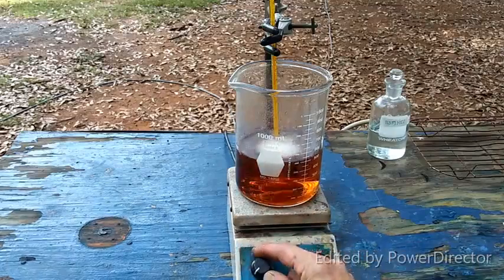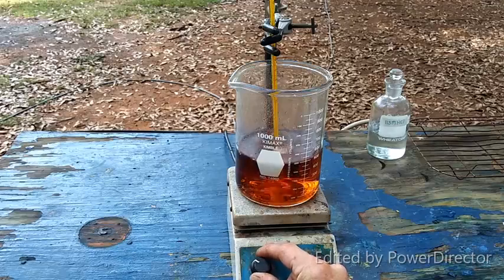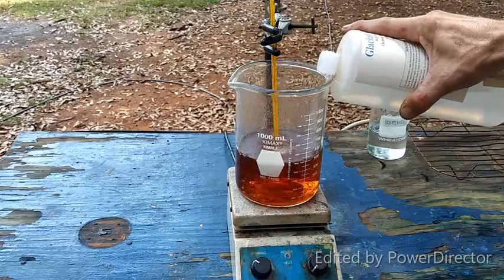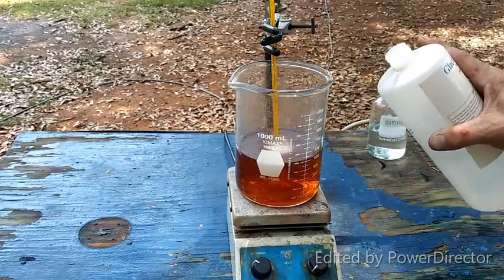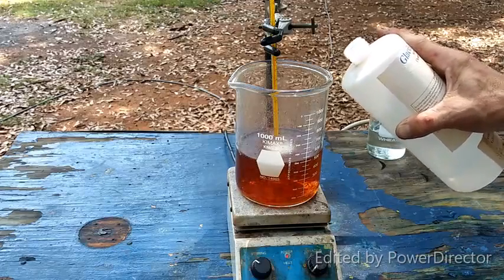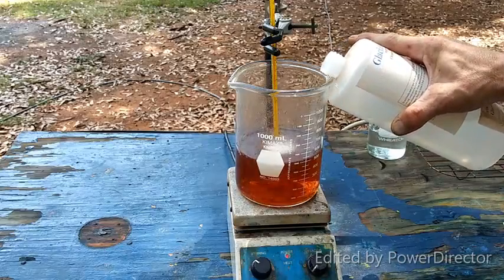Is it precipitating, or are we just getting bubbles? We're just getting bubbles. Okay. Anything? No. Just bubbles.